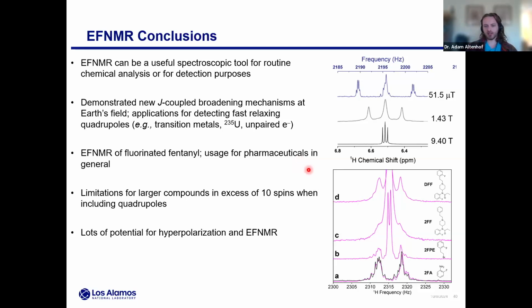Just want to comment that this work was pretty cool to me, because if you look at a lot of low field literature, there's a lot of work on really small compounds, maybe on carbon labels, on alcohols, things like this. So looking at significantly larger compounds at natural abundance is kind of interesting. Certainly interesting for material science. About 30% of all pharmaceuticals are fluorinated anyway, and certainly there are lots of other coupling partners to consider.